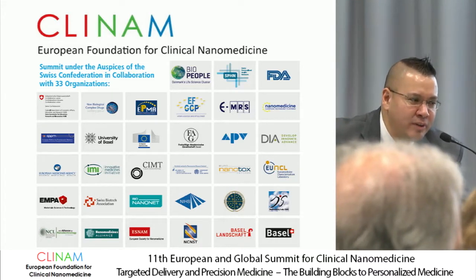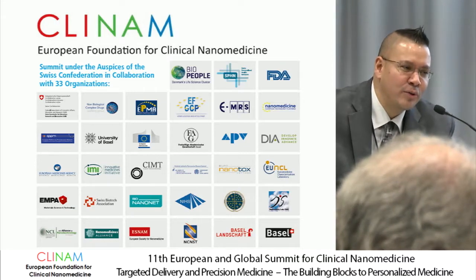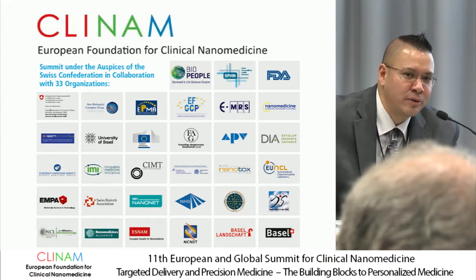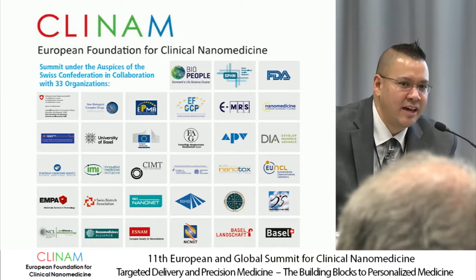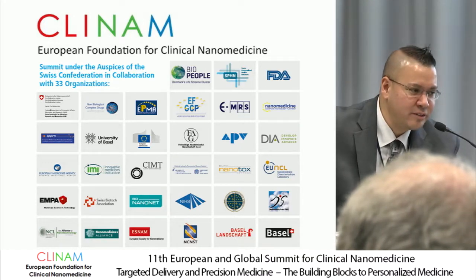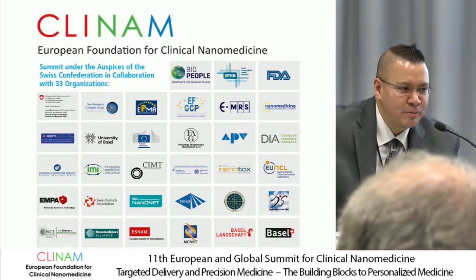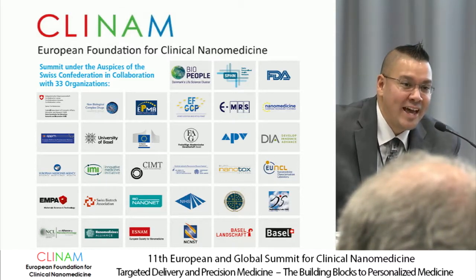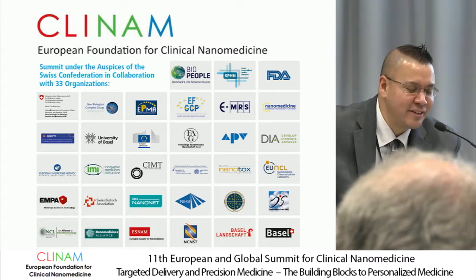So going beyond just giving a number, you need to specify what size that is, along with all the conditions that go along with it: what temperature, what solvent, concentration, things like that. And that goes to your point, Hans, where which size is correct, we don't know. Most people will record size with what they have in their lab. You're not going to do something you don't have, to be honest.